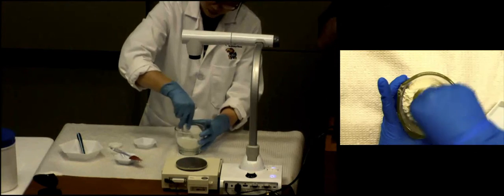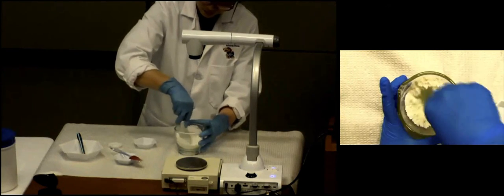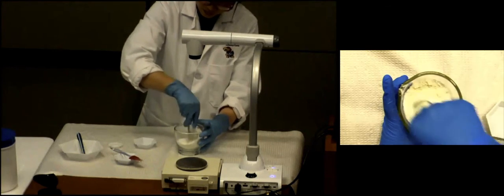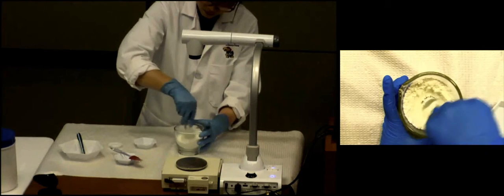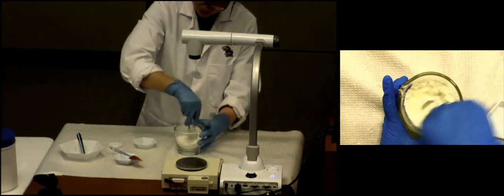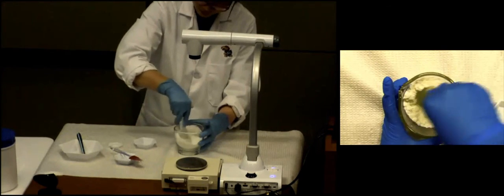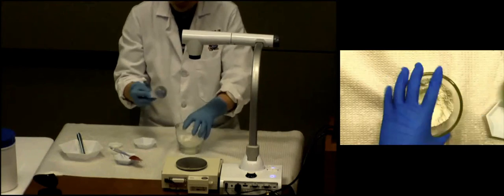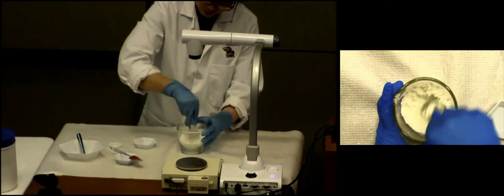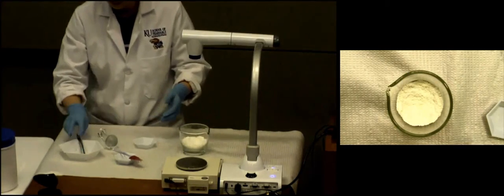2, and it then has a size of the shaker bottle and the actual dosage or the closure container system. So the 2 ounce, in this case, put in a 2 ounce shaker bottle. You'll see that here in a minute. But it's the 22 grams part, and the 2 ounce part, and the shaker bottle part. It's transfer this amount of product to this size container. So regardless of the dosage form, that last line step there is going to have 3 parts to it. You need to make sure they have been completely filled out.